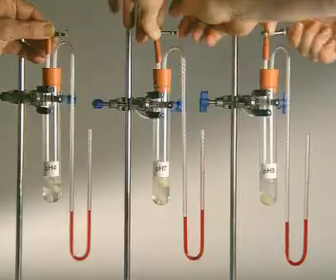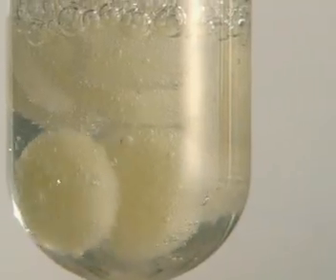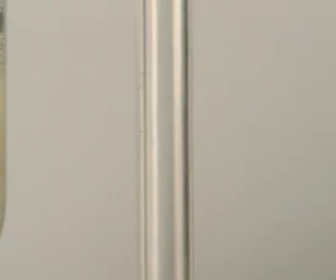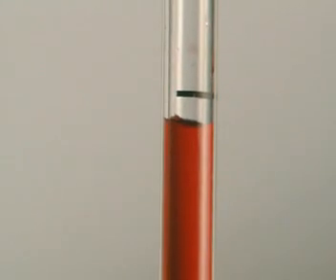The speed at which it rises is a measure of how quickly the catalase is breaking down the hydrogen peroxide. The time it takes for the fluid to rise a set distance is recorded.